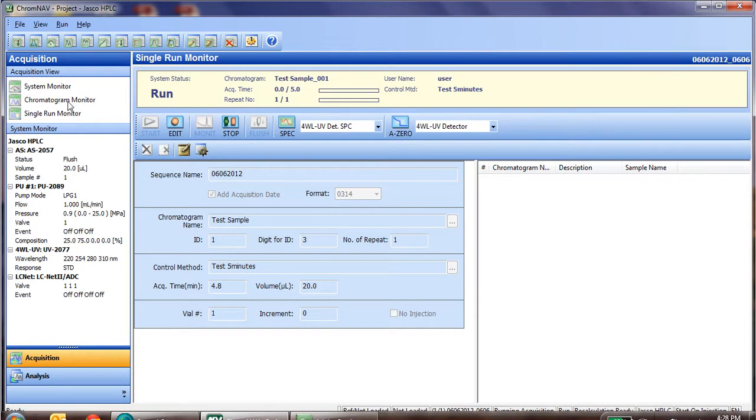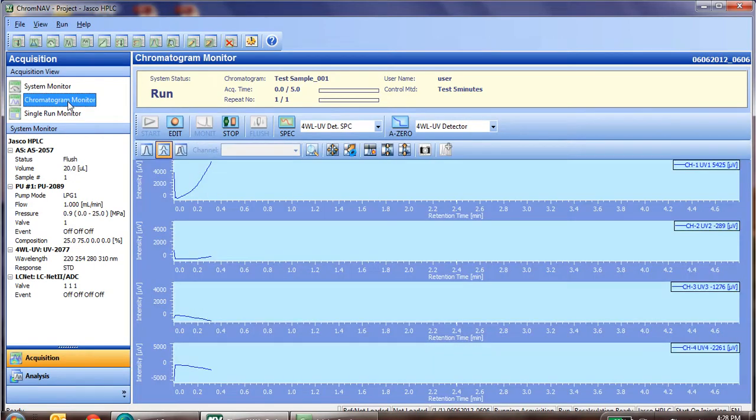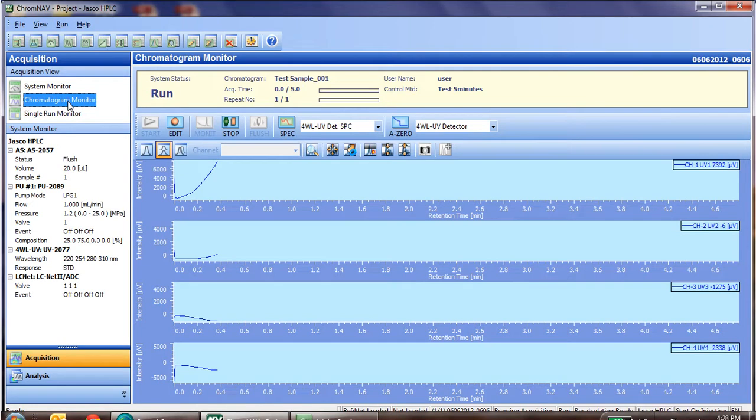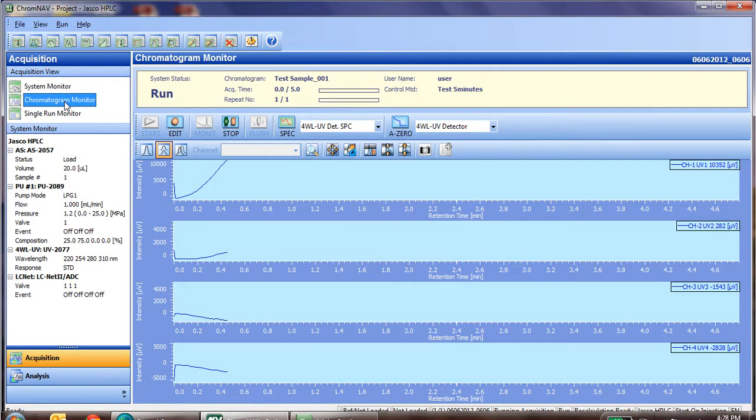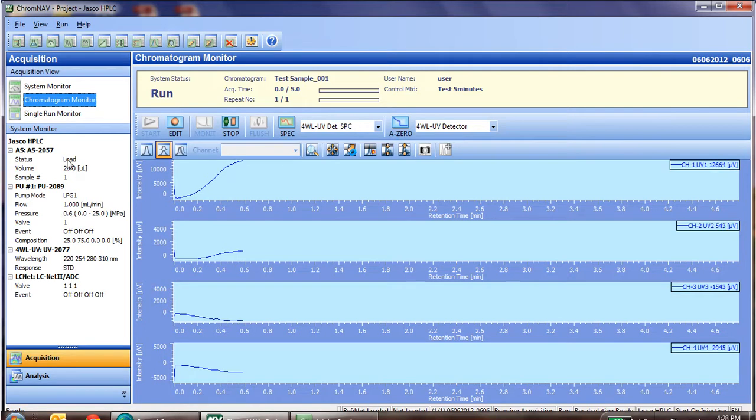While it's doing this, we can go check the chromatogram. As you can see, the auto sampler has now moved to the load position, meaning it's got the sample loop in line with the needle, and it's picking up sample. The injection should occur shortly.